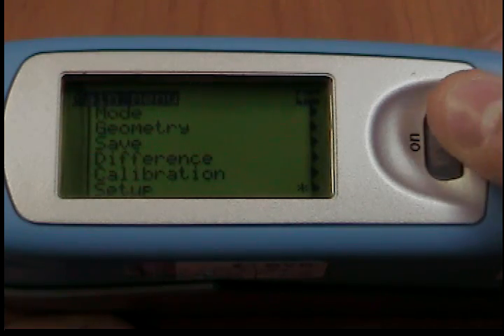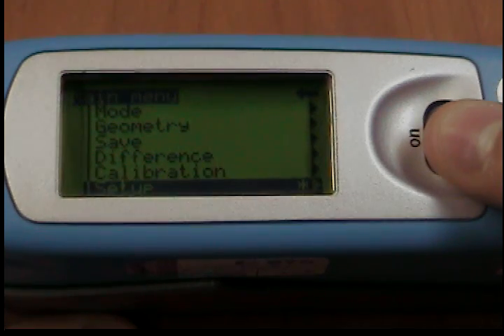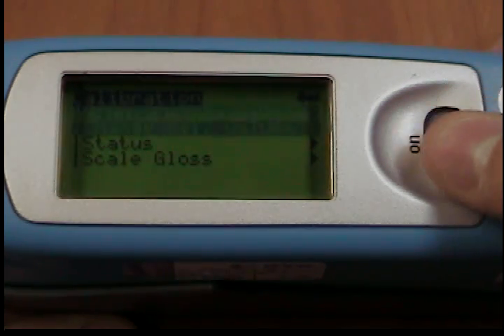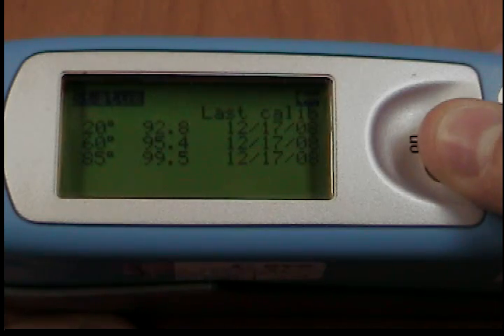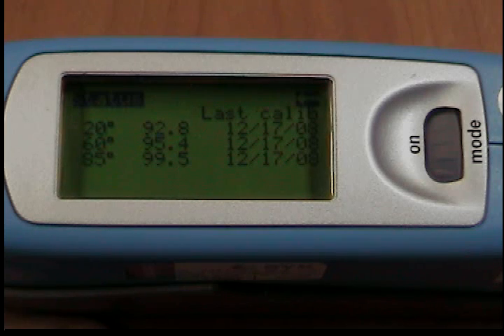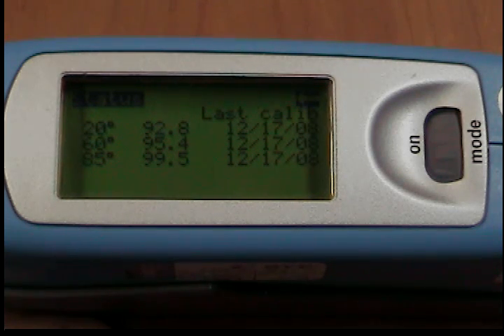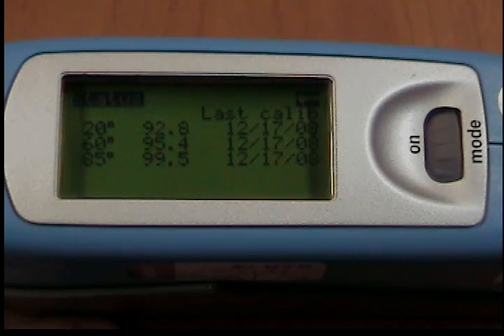The State menu item provides you with information on the calibration status of the unit. In particular, you can check here whether the saved calibration values match those of the holder. The display also indicates if an error message was generated as a result of the last auto-diagnosis or calibration. If this has happened, further information is available under Section 22, Errors and Warning Messages.